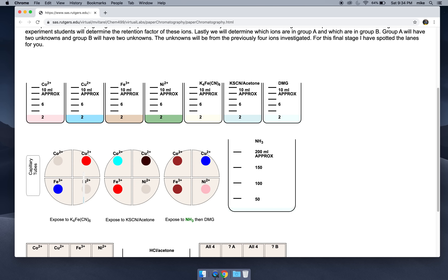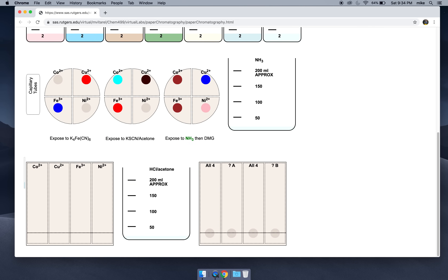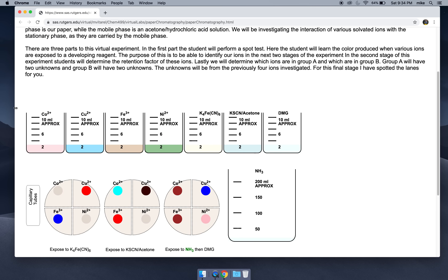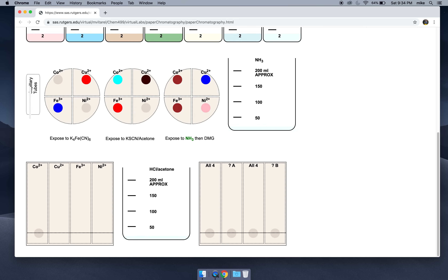So we've picked our four developing reagents for our ions. Let's go to the second stage of our virtual experiment. In this stage, we're going to spot our four ions again. Spot, spot, spot, spot, spot, spot, and spot. We have our four ions spotted.